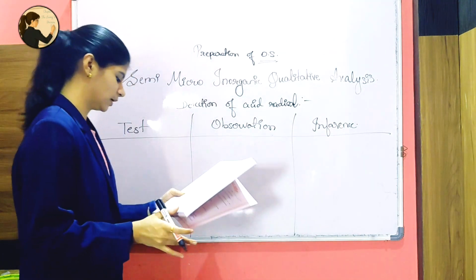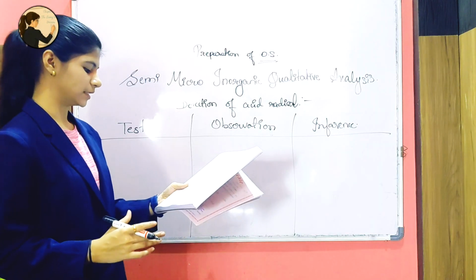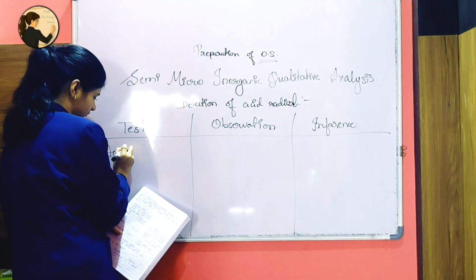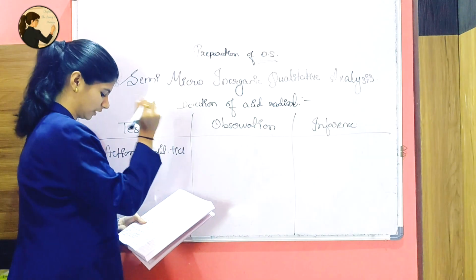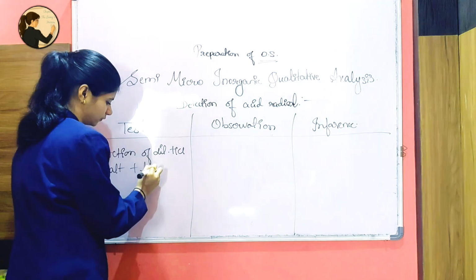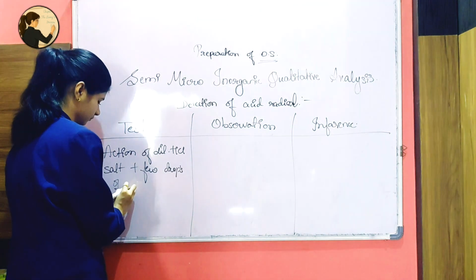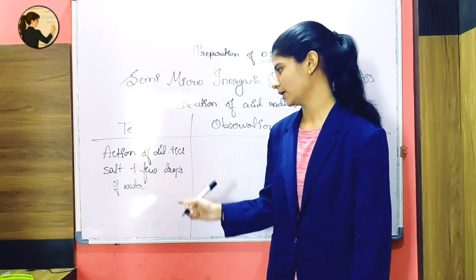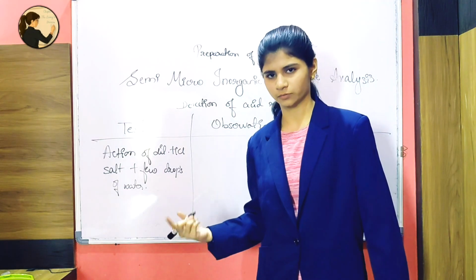Okay? Don't worry. In test, we'll write action of dilute HCl, salt plus few drops of water. Action of dilute HCl, salt plus few drops of water. Now, what will you do after writing this point? You'll be thinking, what is this ma'am writing on the board, right?